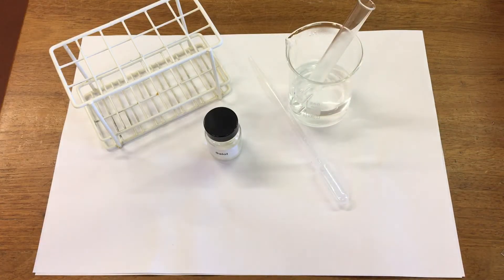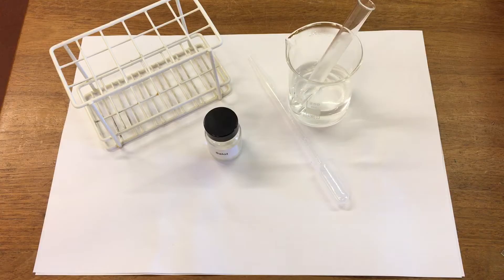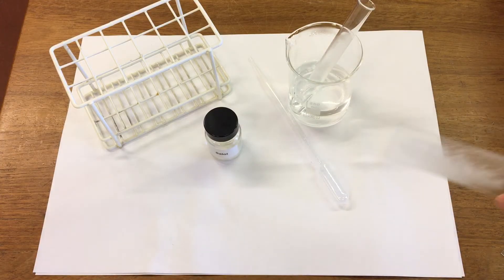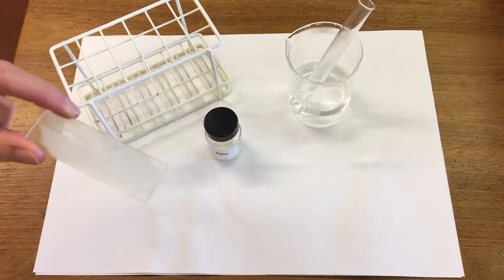We're then going to take some of the liquid salol and pop it on a very cold microscope slide that's just been in the freezer. So there's our cold slide and we'll use our pipette.